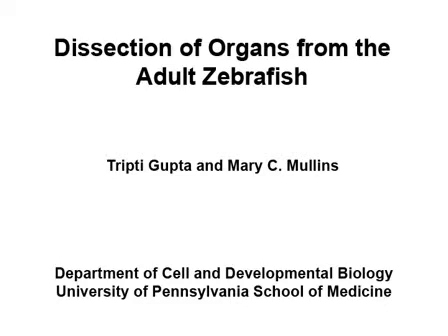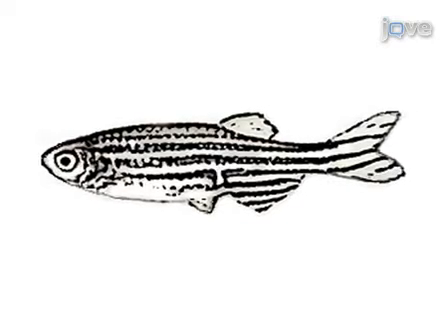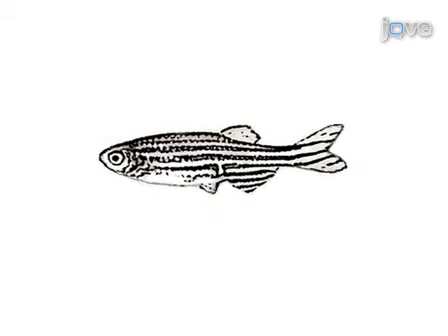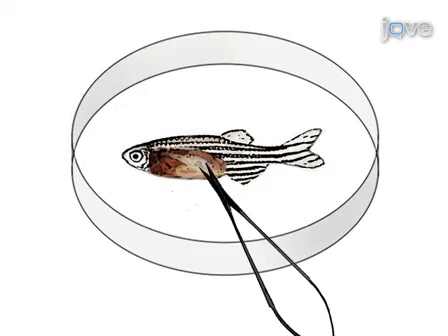Over the last 20 years, the zebrafish has become a powerful model organism for understanding vertebrate development and disease. Although the morphology of the embryo and larvae has been well documented, descriptions of adult zebrafish anatomy and techniques for working with adults are lacking. Mary Mullins' lab at the University of Pennsylvania studies gonad development and routinely dissects ovaries and testes from adult fish. This protocol demonstrates dissection of the gonads as well as identification and dissection of the other major organ systems.